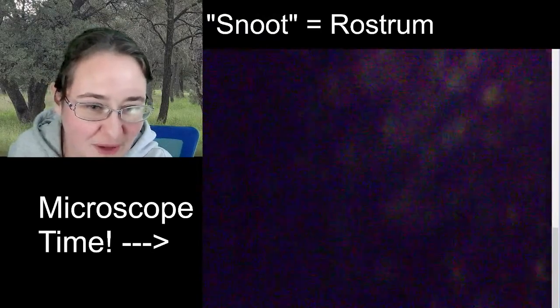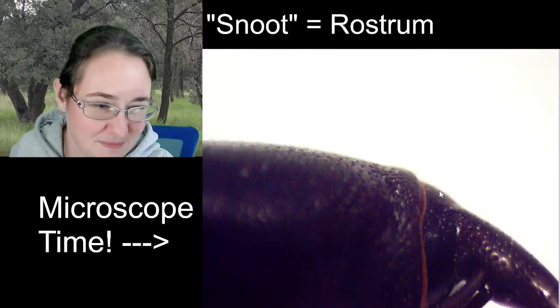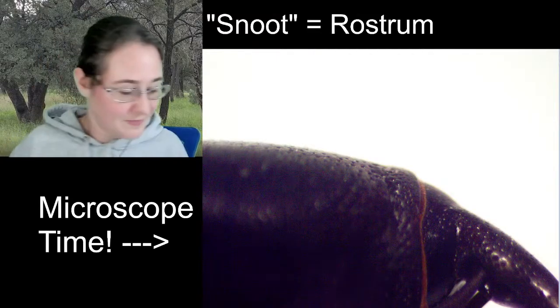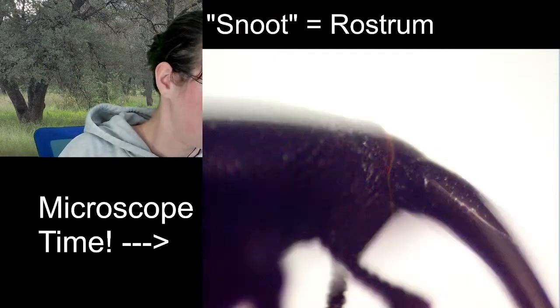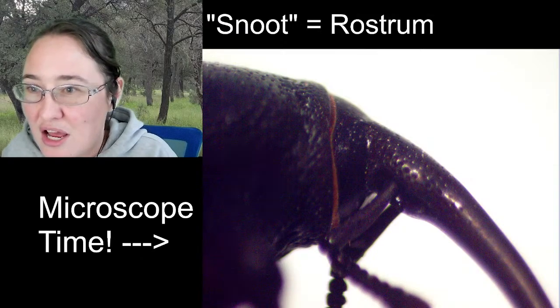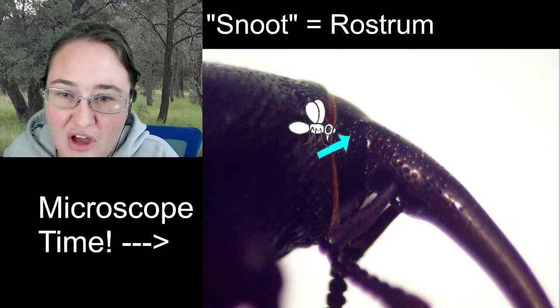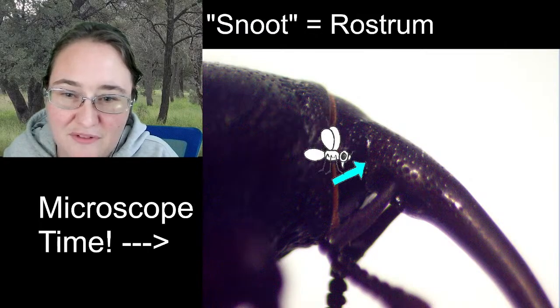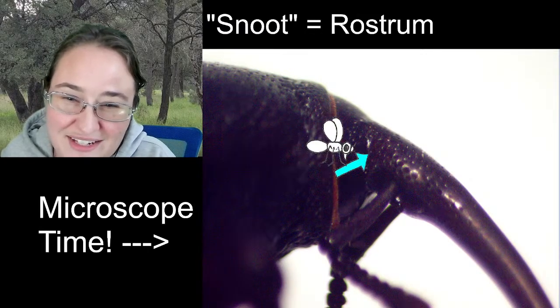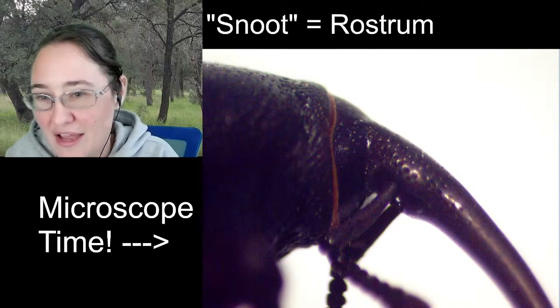So the compound eyes, you're not going to be able to see them. They are very, very dark. So they're black and the head's black, so it's difficult to see, but there is a textural change. So the compound eye starts here and is all the way up to the base of the snoot and then comes back down here. It's pretty much this entire region of the head is compound eye.